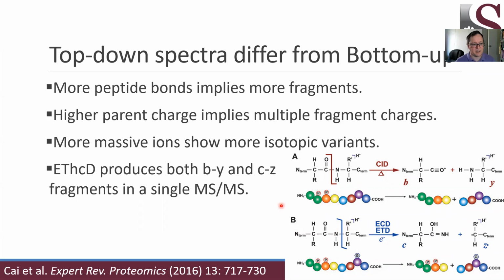Instead of basically barraging the peptide with gas collisions until it breaks apart, not a very gentle process, we are instead causing the protein ion to capture an electron, which creates a radical and causes a destabilization of these bonds. So that's a relatively gentle process.